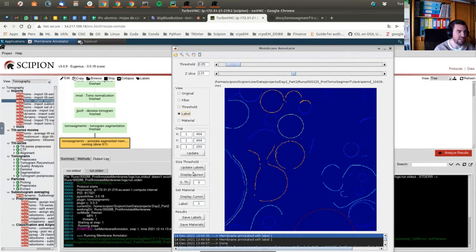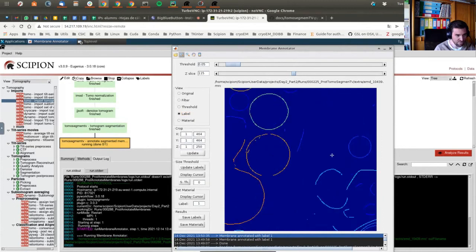And we can discuss the sizes of the target vesicles with the display cursor and then stop cursor. We'll try to make this tool better and more robust in case of the cursors. And at this point, I'm going to do the second one.